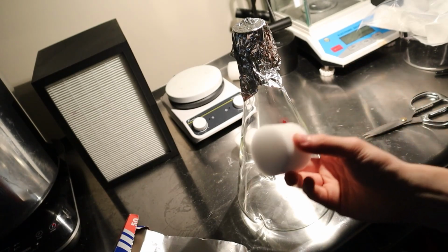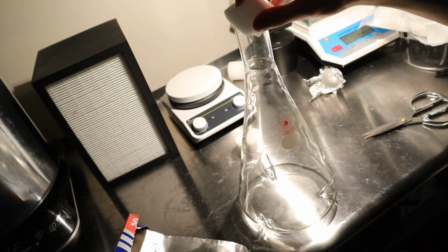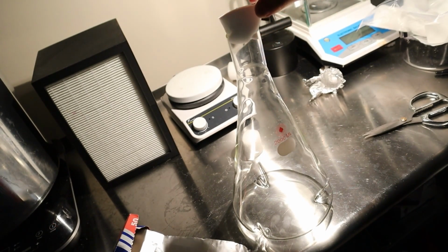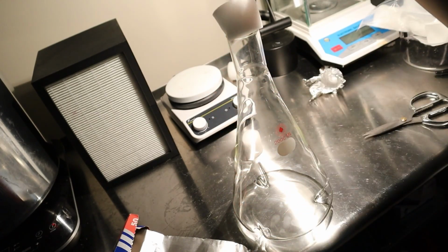I got these perfect. I could just, if I could just find a way to get this in here. Getting this in here is really hard without contaminating it, because look at how low my finger is. When I put this in here, now the part my finger touched is on the inside. Condensation will leak all the bacteria from my finger down into the culture.